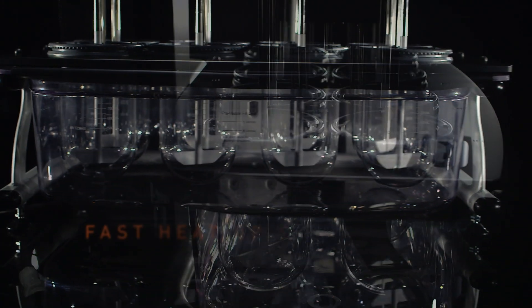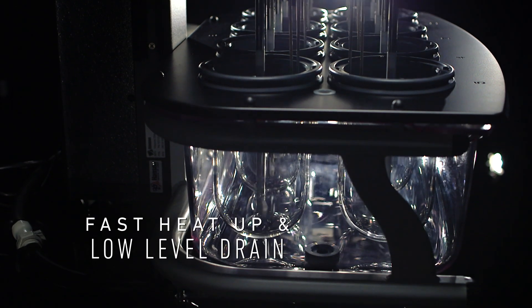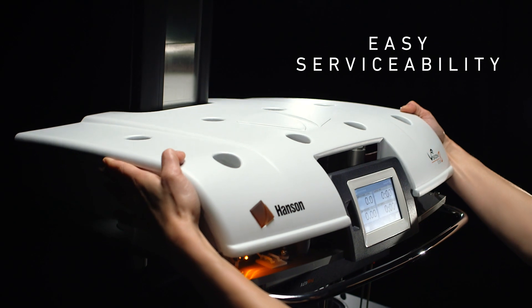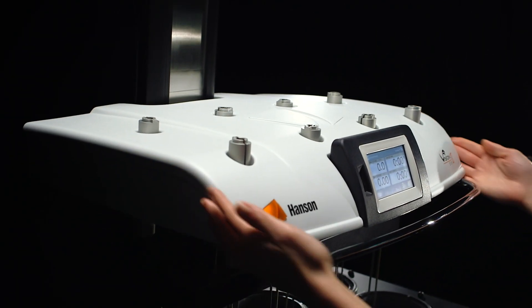Its rugged, molded water bath provides fast heat-up and low-level drain for easy maintenance. Tool-free, pop-off panels make for easy serviceability, which metrologists will love.